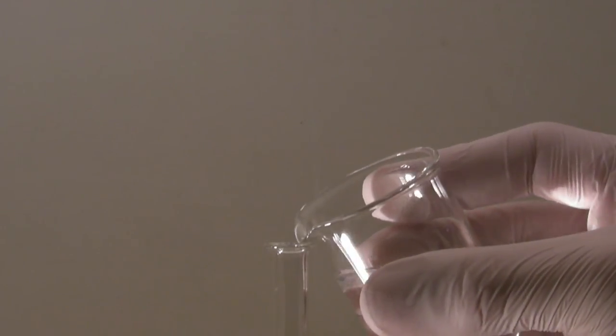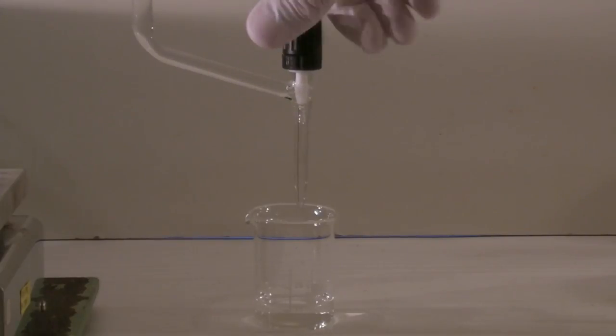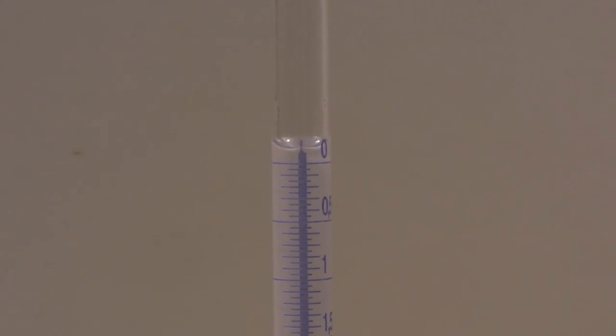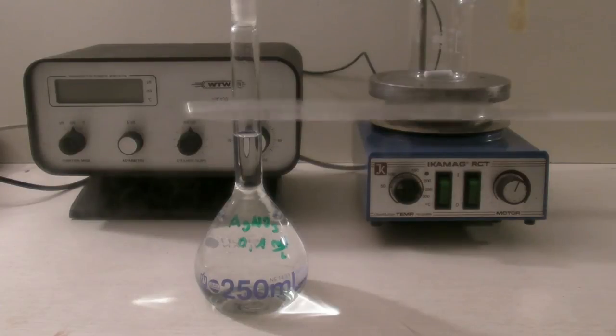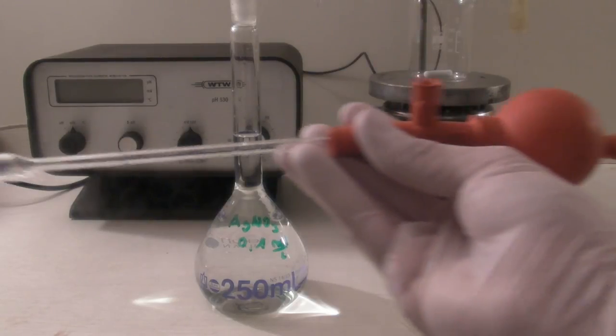Then the burette was filled with a sodium chloride standard solution and it was taken care that no air was left in the apparatus. It was overfilled to make it possible to remove the air from the stopcock. After that, the solution was drained until the surface was at the starting point. With a 10 milliliter volumetric pipette, a sample was taken from the silver nitrate solution.